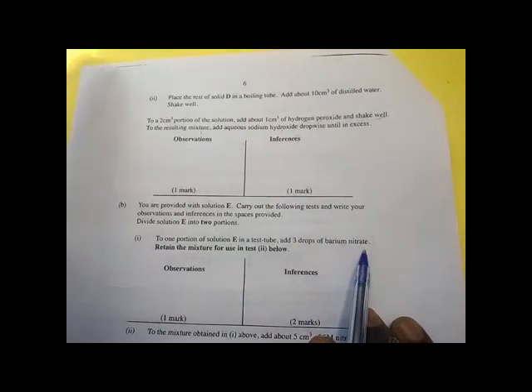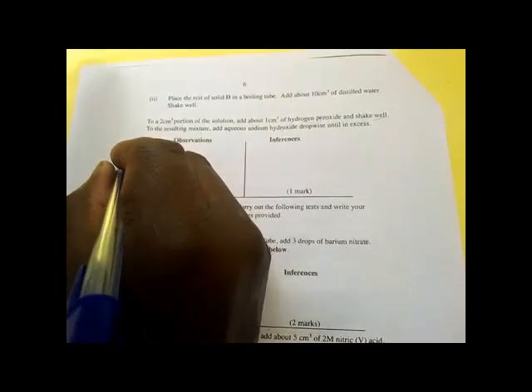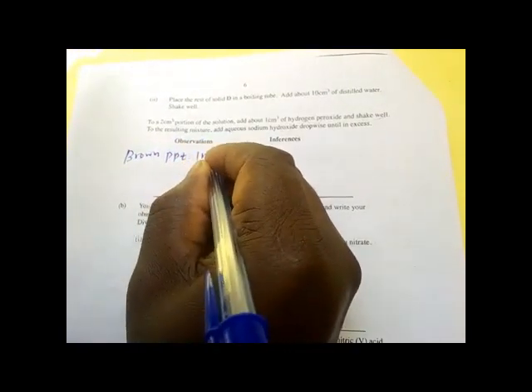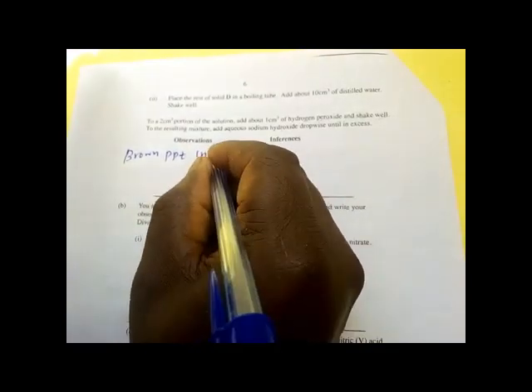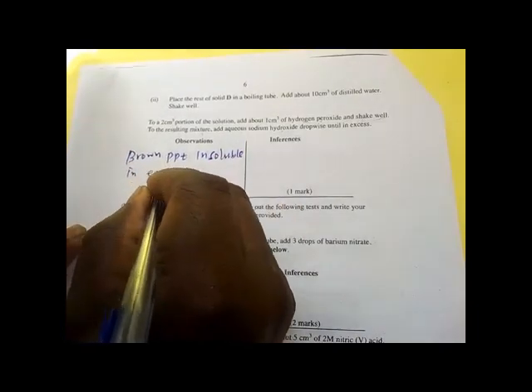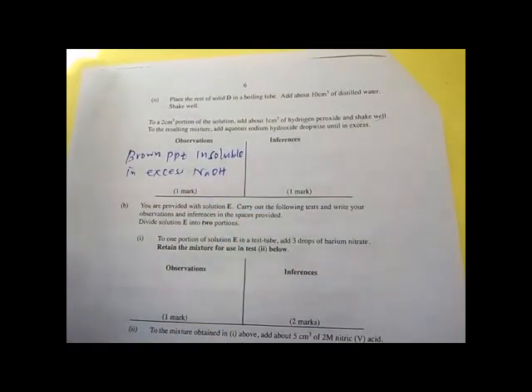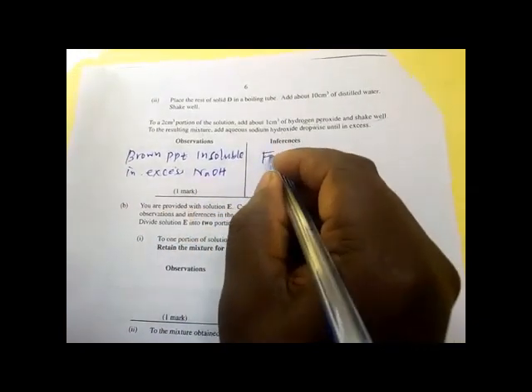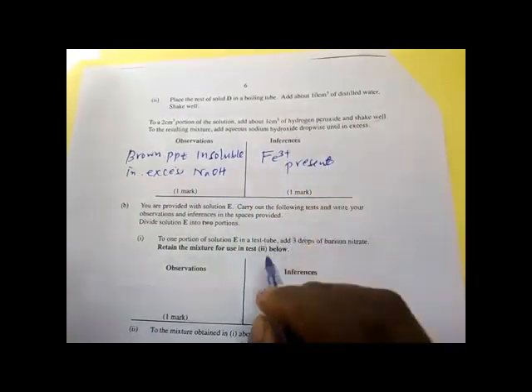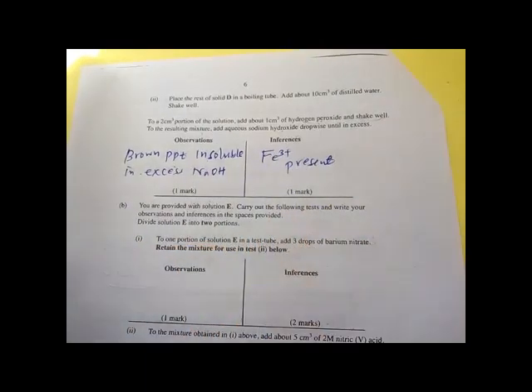So the observation is that a brown precipitate is formed, a brown precipitate which is insoluble in excess sodium hydroxide. A brown precipitate is associated with the Fe³⁺ ion. Brown PPT insoluble in excess, Fe³⁺ present.